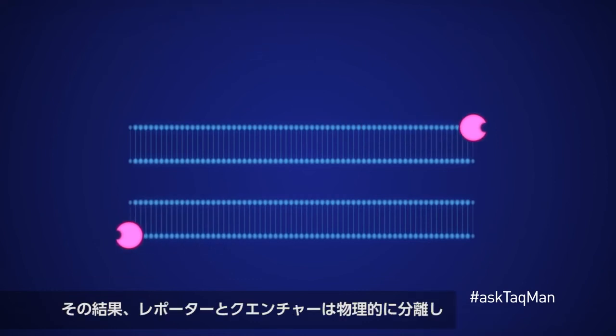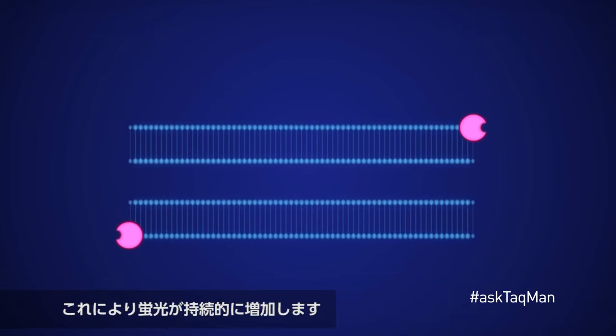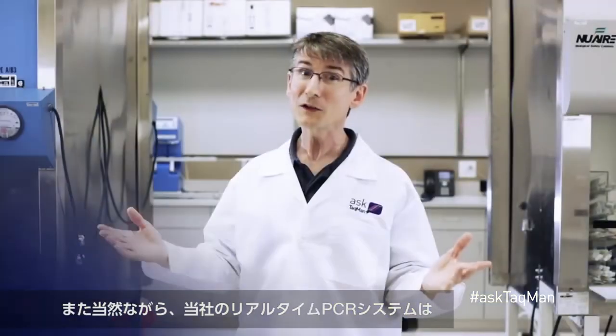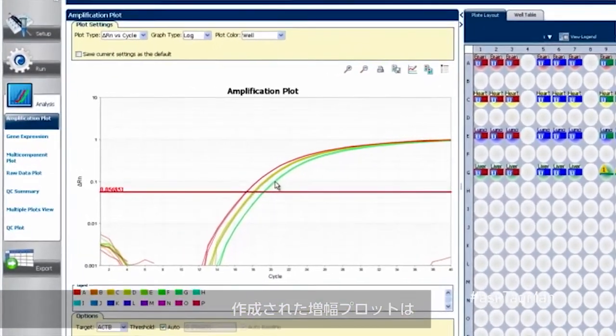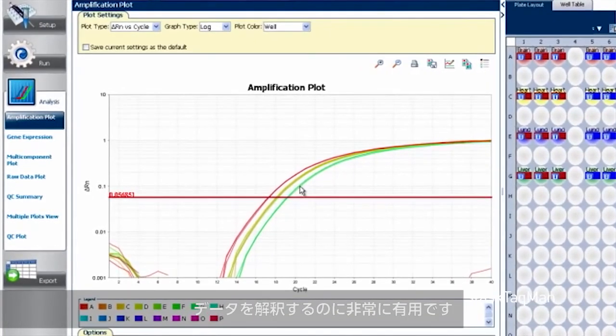As a result, the reporter and quencher are physically separated, creating a permanent increase in fluorescence that, not coincidentally, perfectly accords with our doubling of product. And of course, our real-time instrument can monitor and record this increase in fluorescence after each cycle, generating an amplification plot that's more than a little useful for interpreting our data.